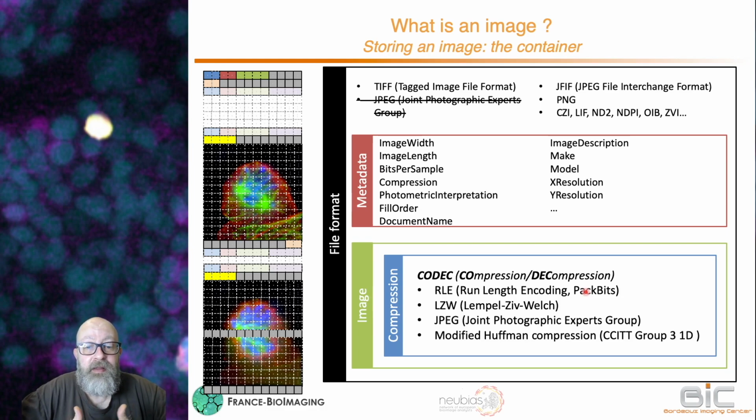Talking about the computer and storing an image, you all have been playing with images. You've maybe been playing with some TIFF images, maybe playing with JPEG images. And if you've been using microscopes, you've been using specific image file formats that come out of the microscopes. So TIFF, in fact, is an acronym for tagged image file format.